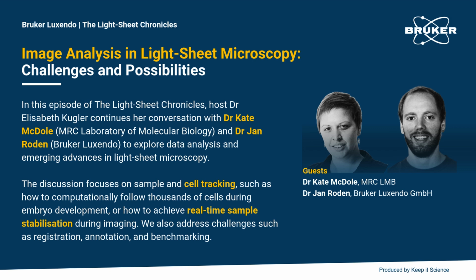If they are fused together, but if you have not sufficiently accurate registration, then smoothly keeping track of the cells across different views is going to be difficult, right? And then you also have, on top of that, the samples can of course wobble because the stage is also moving.